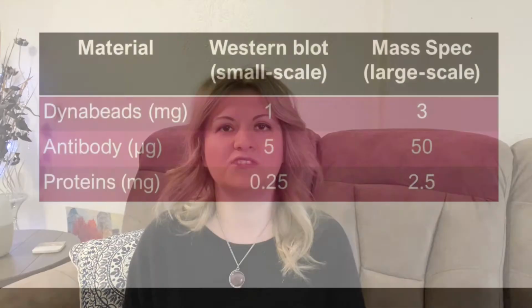During my postdoc, I spent a lot of time, and I mean a lot of time, optimizing my experiment for interactome analysis. So I'm going to share what were my best conditions, the most optimal conditions. And the good thing is that now when I work at a mass spectrometry core and I'm dealing with a lot of interactome analysis from other researchers, those conditions kind of work for the majority of you guys. So I'm going to share the table with these values.